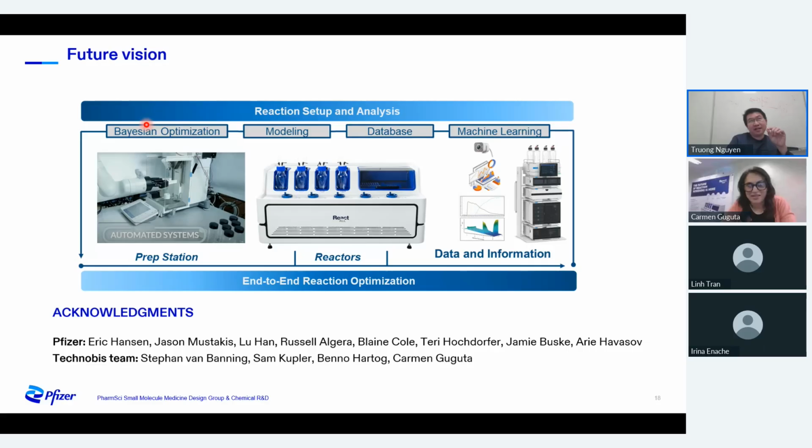The important thing to point out is that even when it moved up in the smart cap, it didn't precipitate, assuming the temperature dropped at the top of the smart cap. But if you take the reaction out, it completely precipitates. So temperature control is quite important.